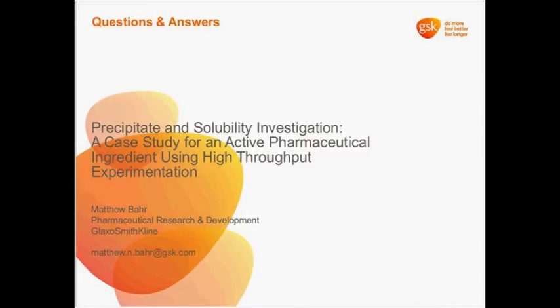In the case of the n equals 4 on the first experiments, it's mainly because of the amount of time that it takes to collect the samples. And then with the later experiments that take, for example, 4 hours or beyond, I have a little bit more flexibility with the amount of time because it's a 4-hour experiment. So I have a little bit more wiggle room with collecting the actual samples.